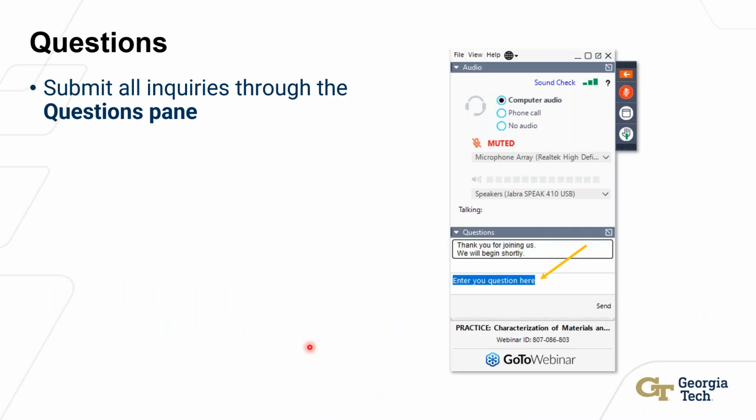In terms of the local strain, that gets more challenging because you would need a fiducial marker, essentially. And there are a few ways you can do that. You can use roughness of the edges of your samples as a fiducial for a virtual extensometer. That would give you the average strain across the width of your sample.